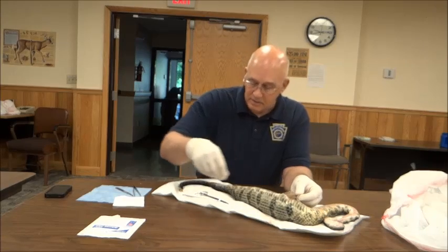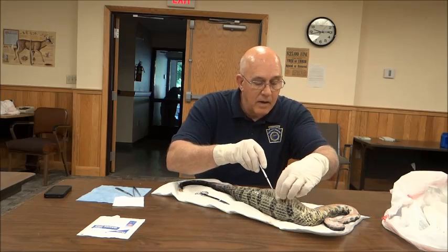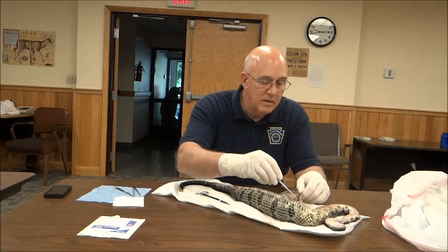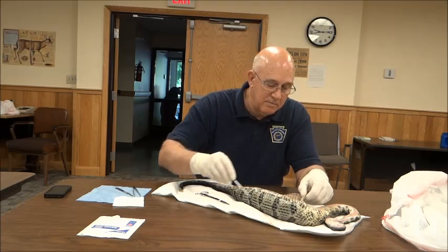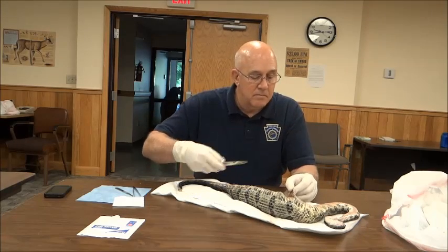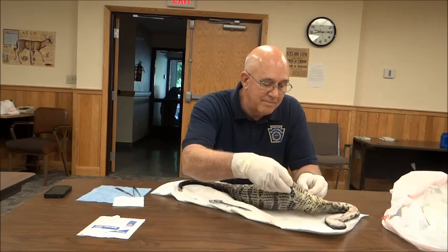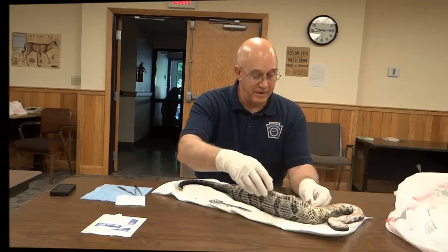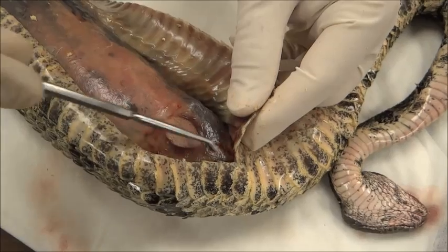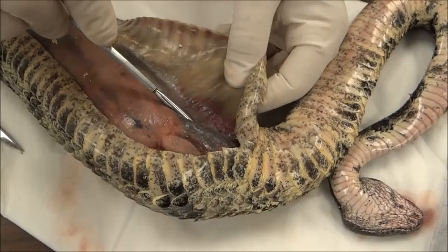Right there was an eruption or something. That ruptured right there — that ruptured while the snake was alive, and that's how the blood ended up around there, up here.